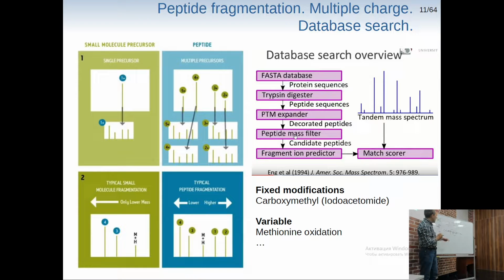For instance, will those two fragments have any meaning to us? Will they help us to search the database? No. Will they be in a lot of different proteins, peptides and so on? Yes. Do we need to search them? No. So we can use this peptide mass filter to filter those out.